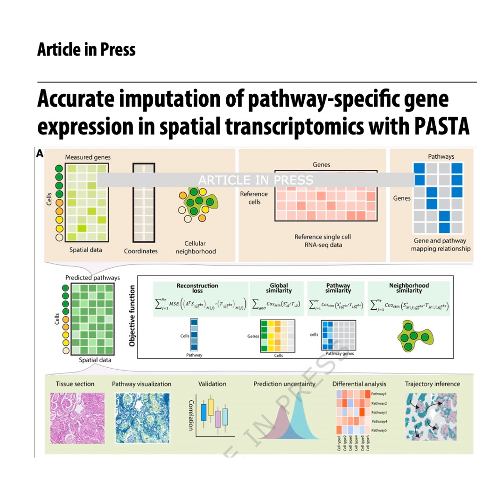Okay, coach number 2, the global similarity check. This one handles the big picture. Since we are merging data from 2 totally different technologies, this check makes sure that the overall transcriptome profile of the mapped single-cell data broadly matches the spatial data. It's a general alignment across all the genes that the 2 datasets share. It just maintains global coherence.